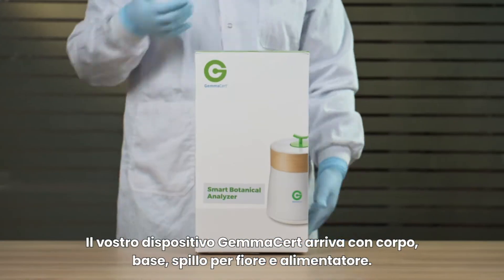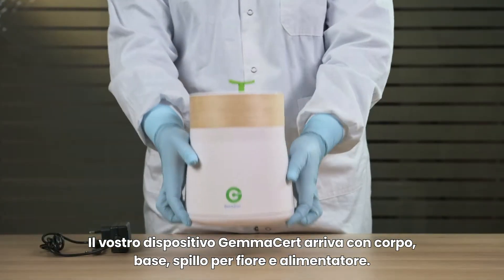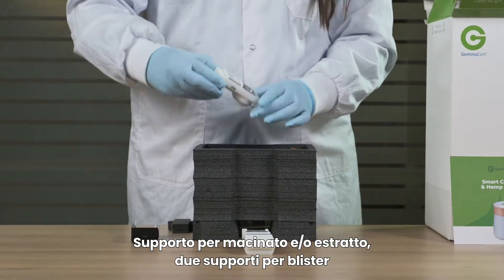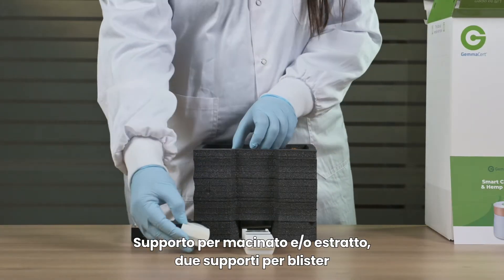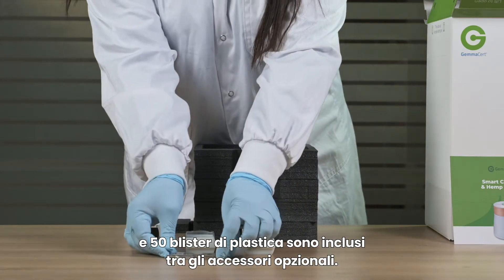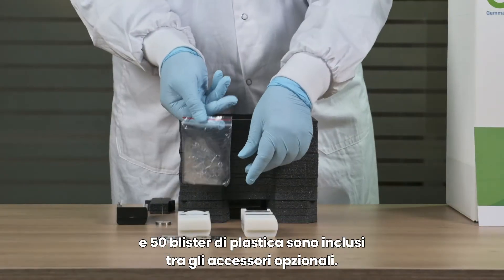Unboxing. Your Gem Assert device arrives with body, base, flower pin, and power supply. Optional accessories include ground and/or extract holder, two blister holders, and 50 plastic blisters.